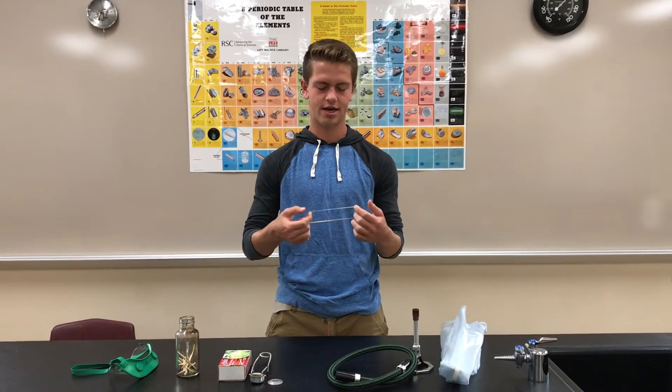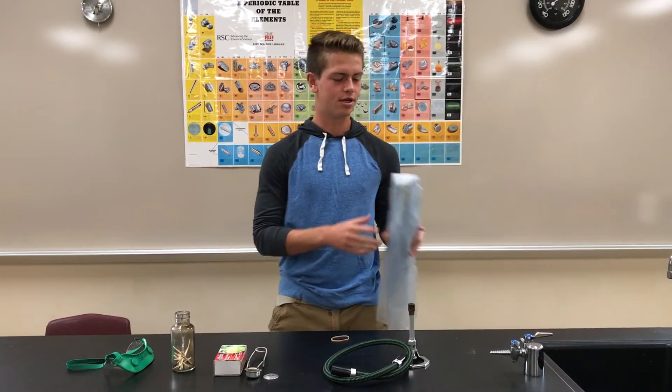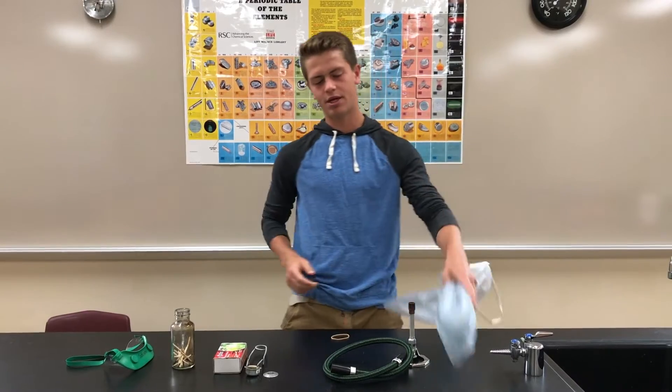The second safety step is to wear lab-appropriate clothing. That means only closed-toed shoes — no flip flops and no crocs. It means to tie back any hair that is shoulder length or longer with an elastic band. In some cases it will mean wearing an apron to prevent hot materials from spilling over you. It will also mean not wearing any loose or baggy clothing.